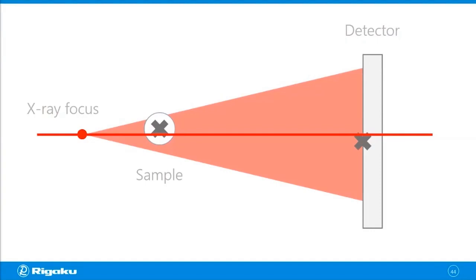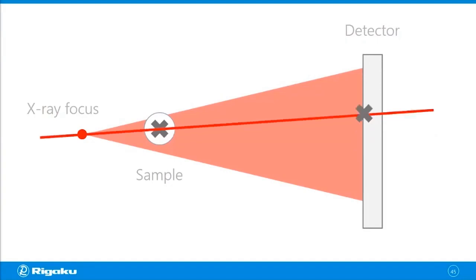When this happens, the center of the detector is just a pixel or location we're picking as a center. You can shift it so that the X-ray focus, the sample rotation center, and the detector center are still on a straight line. And this shift is the focus correction or center correction. And there are many little things you can correct during the reconstruction process, but this correction of the center position on the detector is one of the most important ones.